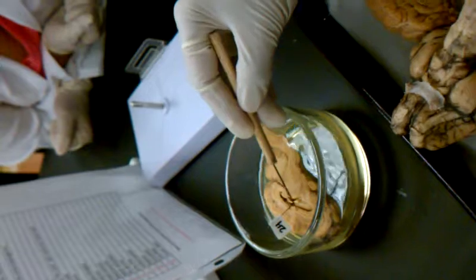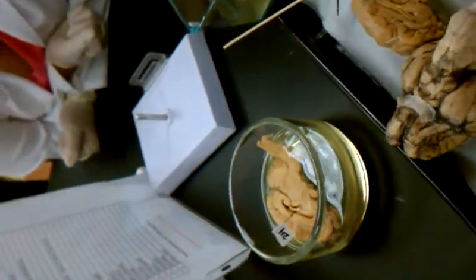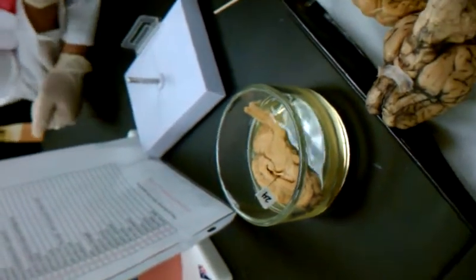It's not the space, right? No, above the space. That's your corpus callosum, like a headset. That's what we were just talking about, right? Okay. So it's the C.